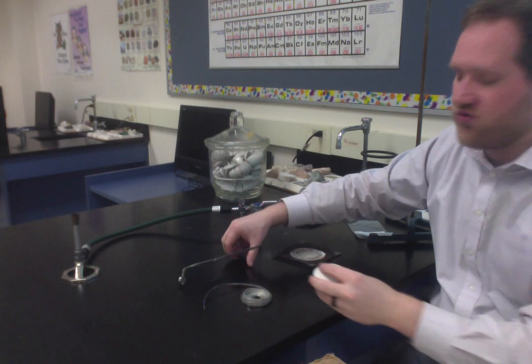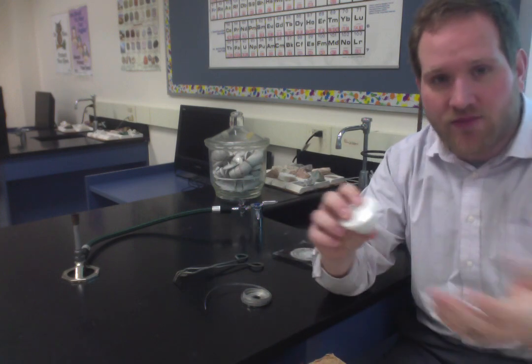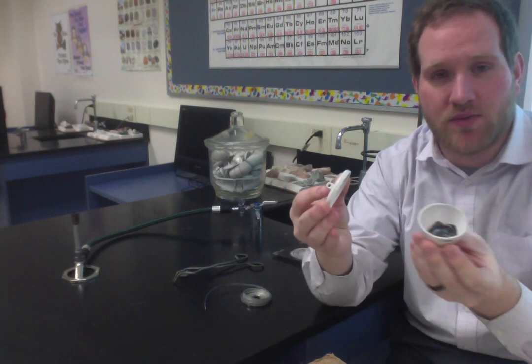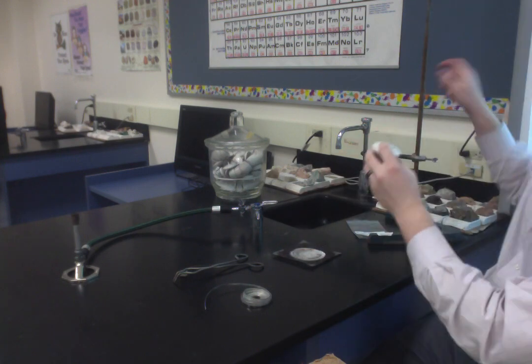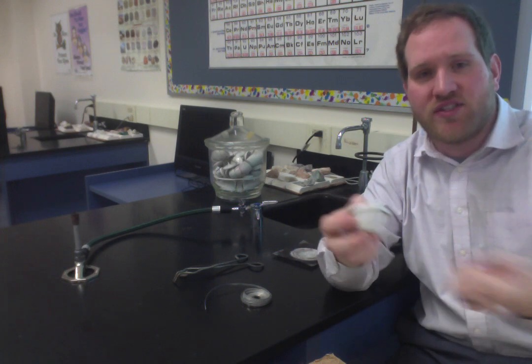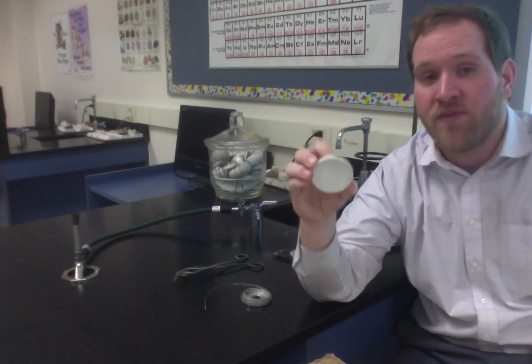So to burn it in a controlled way, we use this, which is known as a crucible. You may have read the novel The Crucible about burning witches in Salem. Well, in a crucible in chemistry, we burn things inside this. And your lab procedure will probably have you find the mass of this. It'll probably have you find the mass of just the lid as well, separately.